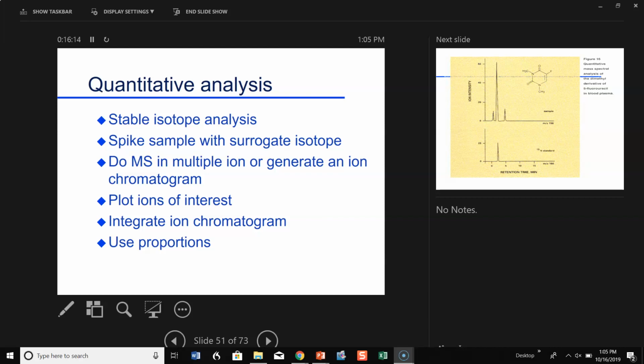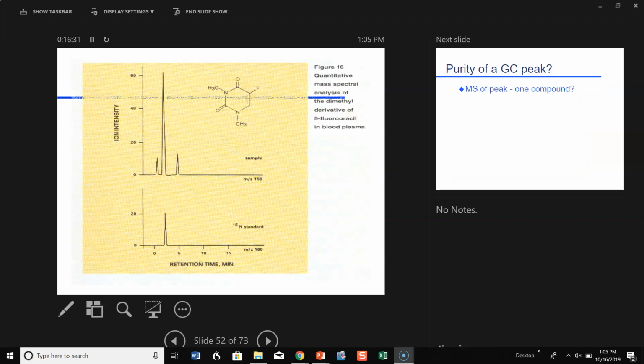If my flavor has 10 components, that's $100,000. If there's 100 components, it's costing me $1 million. Okay, I'm not going to use it too often. It has to be something that's done routinely, and it has to be worth it. So, beautiful method, but exceedingly expensive to use.